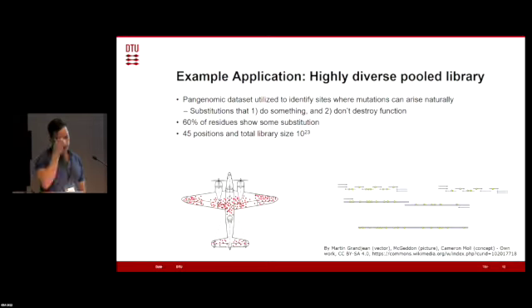And so of those, we managed to get 45 positions into the design. And I did exactly as I talked about with the Codon Genie. So if I saw a residue, it could be an alanine in the wild type, and then cysteine or tryptophan showed up in the data set. Those were the 3 potential amino acids that went there. So it was really combining mutations that existed in nature with the wild type and pooling them all together to see what we got out. And this is just sort of an example of how it would look with the degenerate codons.